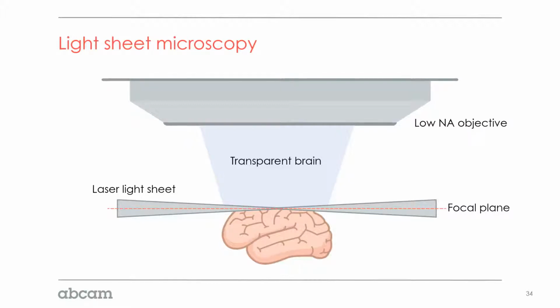But again, these are not very common. Sample prep is relatively challenging, and these are not able to be easily automated like you can with confocal microscopy.